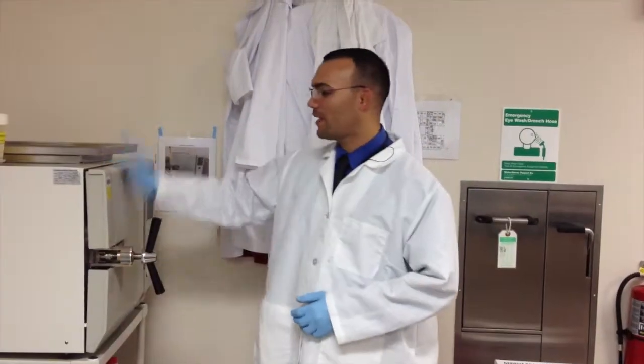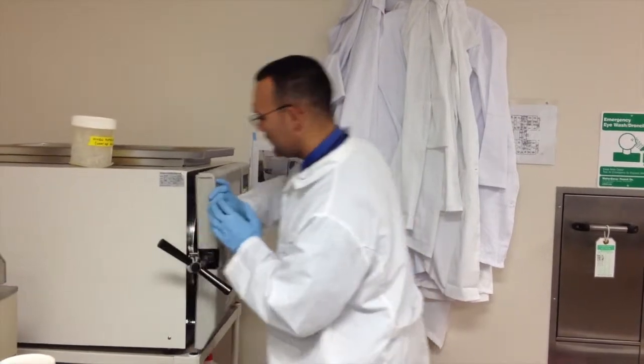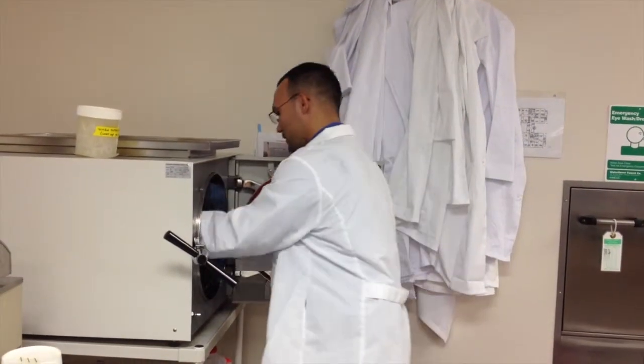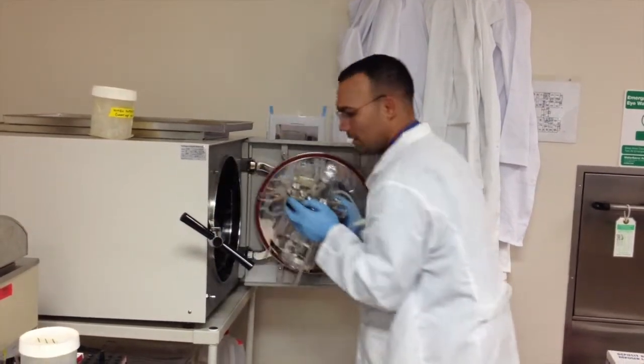Ding! Alright, our autoclave is finished. Alright, we're going to unscrew it here, open it up. We're going to take out our bioreactor. Alright, that's an autoclave. Alright, we'll take it over to the table here.